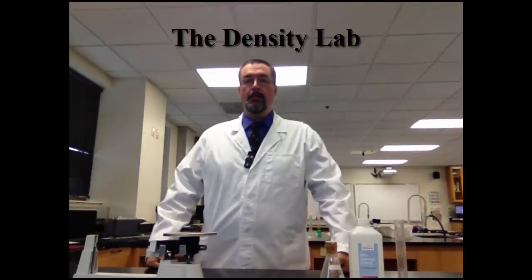Welcome back to lab. Today we're going to talk about the density lab and take a look at some of the equipment and procedures that you'll be doing for this lab. There's a lot going on. There's really two parts to the lab, the density of solids and the density of liquids. And the process is essentially the same whenever you're determining density.